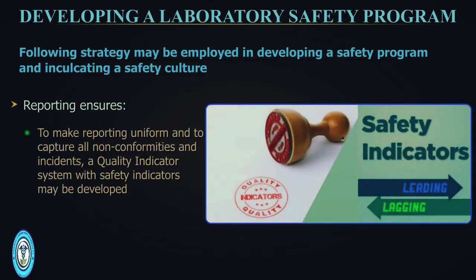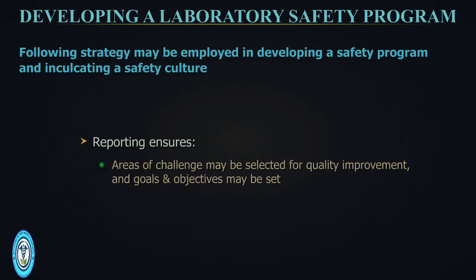To make reporting uniform and to capture all non-conformities and incidents, a quality indicator system with safety indicators tool may be developed. Areas of challenge may be selected for quality improvement and goals and objectives may be set.